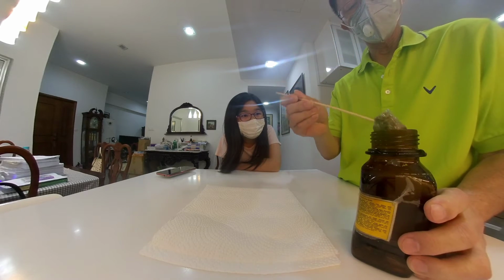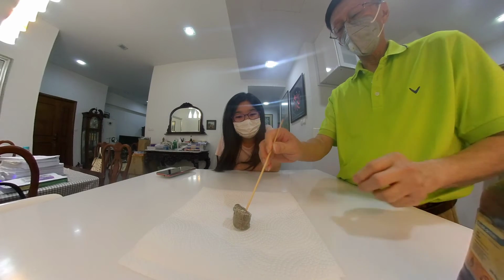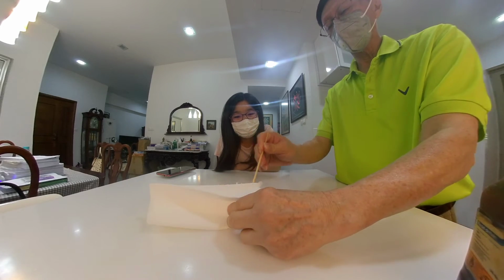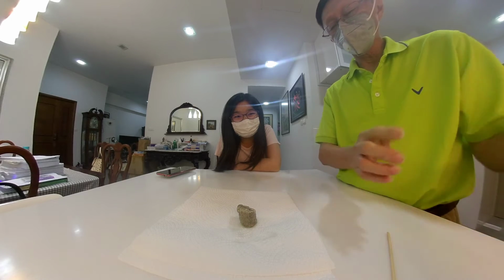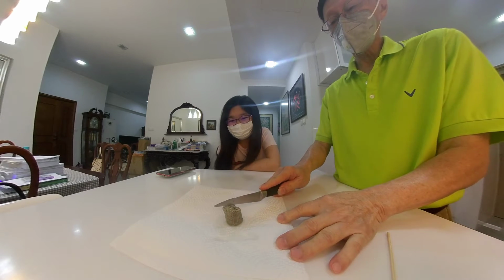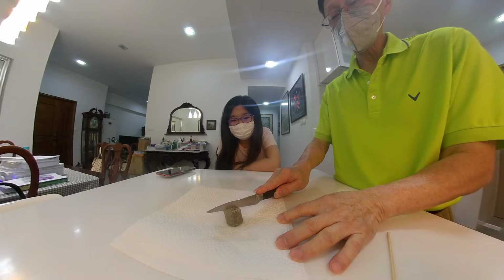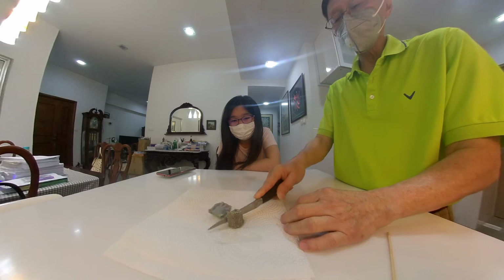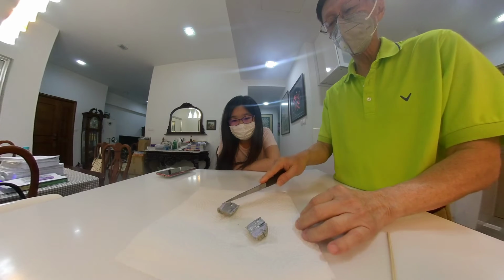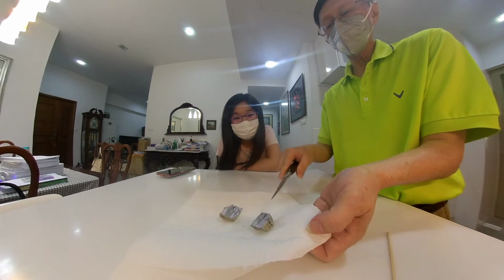Now this is a big piece. Now this big piece will give you a big explosion. So we don't want to use this big piece. We cut it in half using a knife, and the knife will be able to cut it through and expose a very shiny surface. Can you see the shiny surface there?